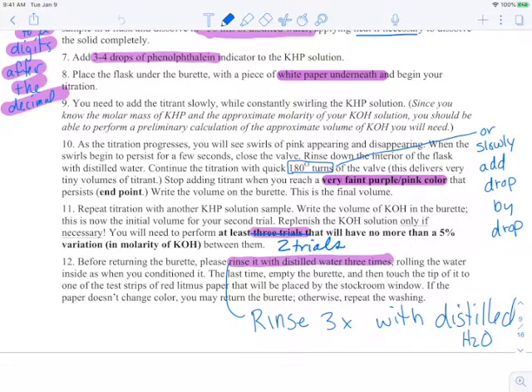So just to try to encourage you to watch it, Dr. DA talks for 5 or 10 minutes about acid-base titrations. And then he's going to show you exactly what happens in this lab. He even does it with his goggles on, like so. So that's me again encouraging you. I know it's 30 minutes of your life, but it's 30 minutes of your life well spent.